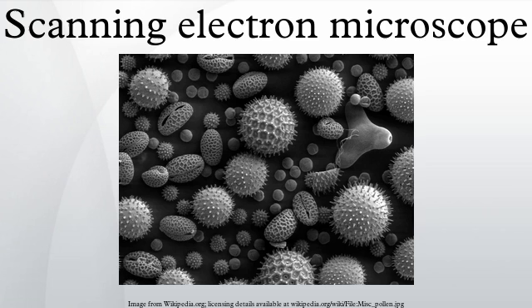Specimens can be observed in high vacuum, in low vacuum, in wet conditions, and at a wide range of cryogenic or elevated temperatures. The most common mode of detection is by secondary electrons emitted by atoms excited by the electron beam. On a flat surface, the plume of secondary electrons is mostly contained by the sample, but on a tilted surface, the plume is partially exposed and more electrons are emitted. By scanning the sample and detecting the secondary electrons, an image displaying the topography of the surface is created.